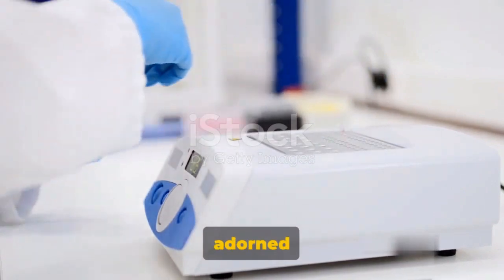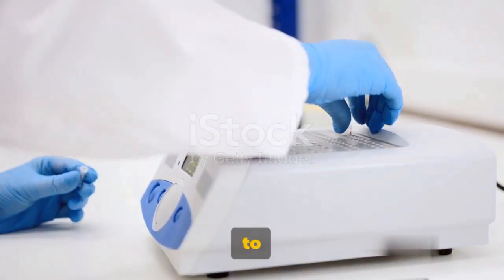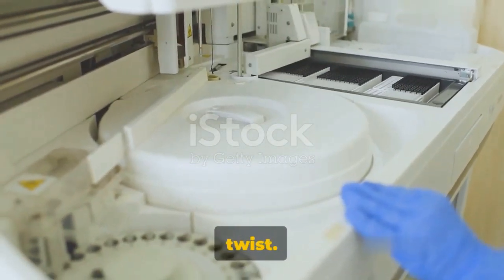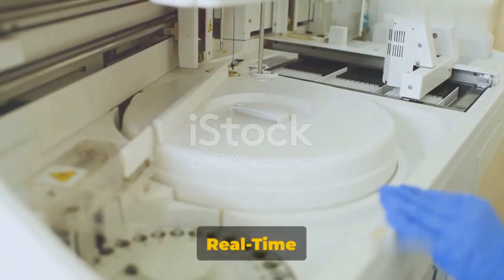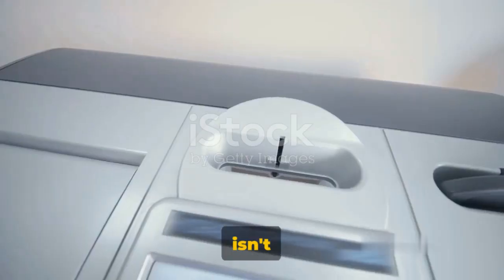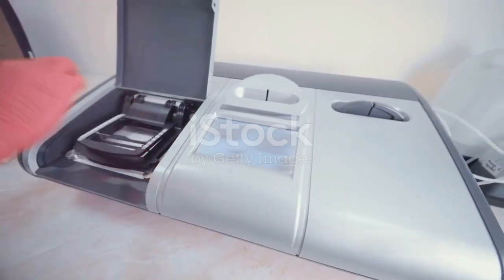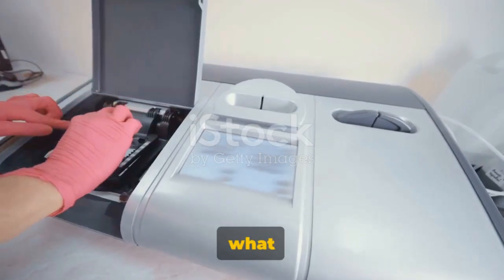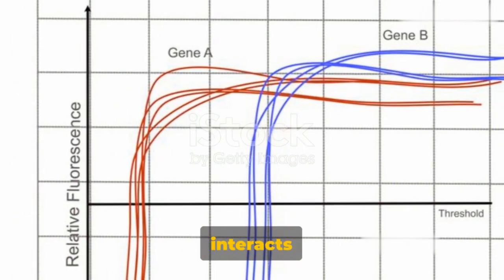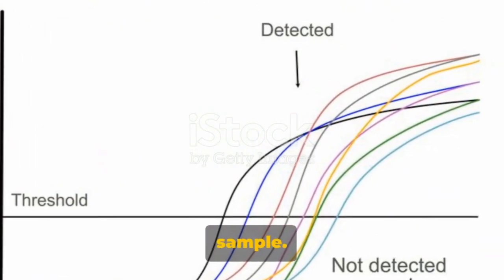The specimen, adorned with our fluorescent marker, is placed in a well and subjected to a thermal cycle, just like in normal PCR. But here's the twist. The machine used in real-time PCR is subjected to a light source. This isn't just any light source, it's a tungsten or halogen source. This specific light source is what causes our fluorescent marker to shine. As the light interacts with the marker, it begins to fluoresce, lighting up our DNA sample.